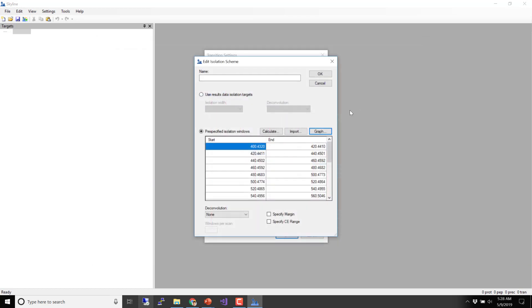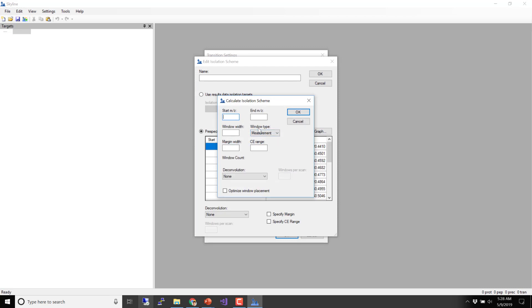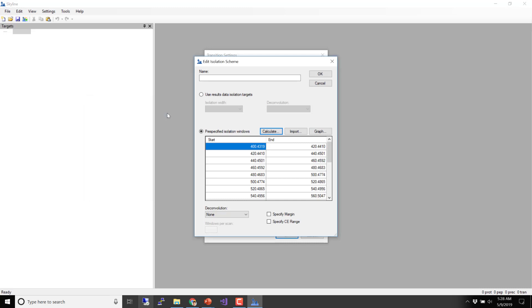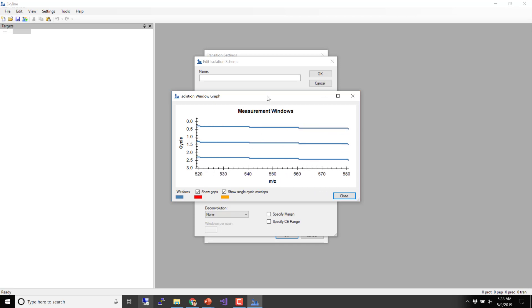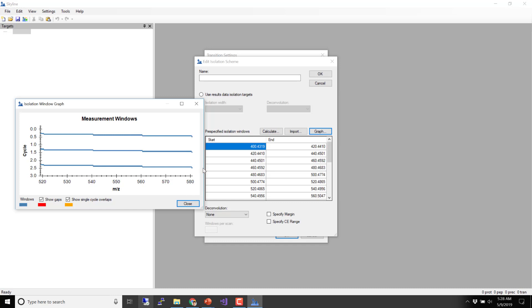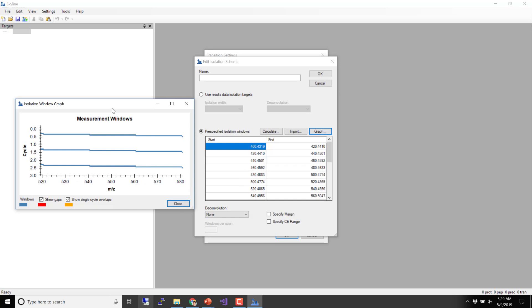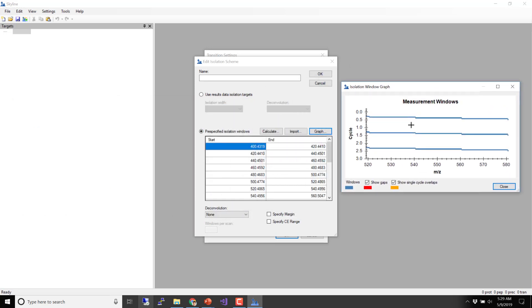Are these regular intervals or is every single gap in an optimized place? Every single gap is in an optimized place. This isolation scheme was actually calculated — I can click Calculate, say 400 to 800 with window widths of 20, and say I want optimized window placement. That's all I have to do. And I get basically the same windows. The windows are stored very precisely — we're only showing four decimal places, so there are no more gaps. The tiny gaps you saw were due to exporting into the Thermo software.